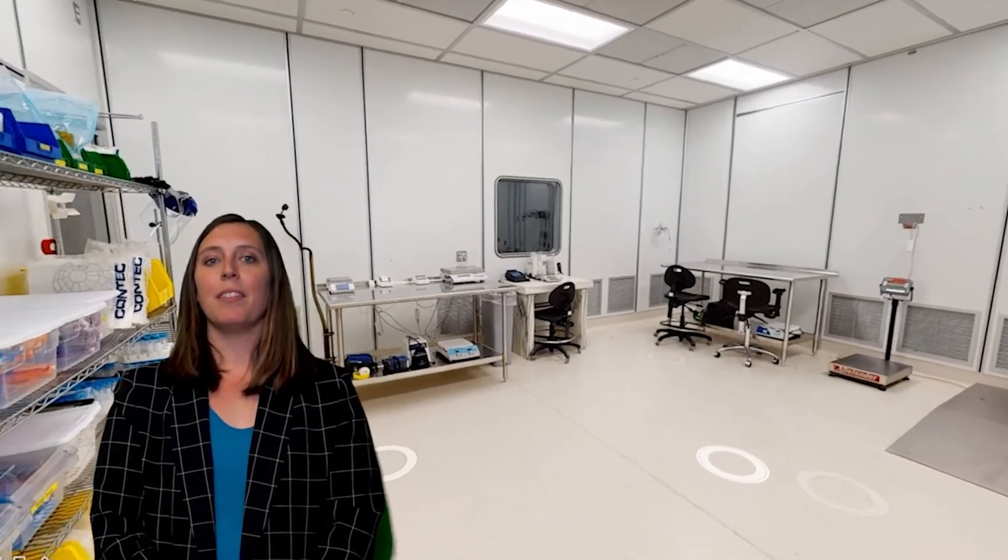Hi, my name is Katrina Stolke. I am the formulation manager at BSM, and I have worked here for two years. Welcome to our formulation room. This is where we make the liquid medicine.